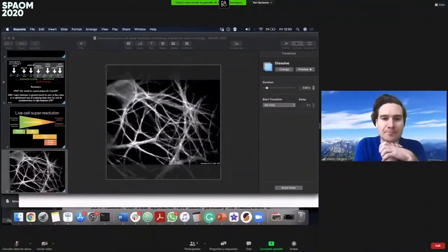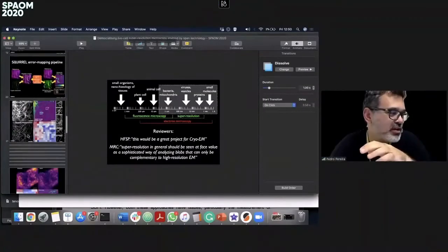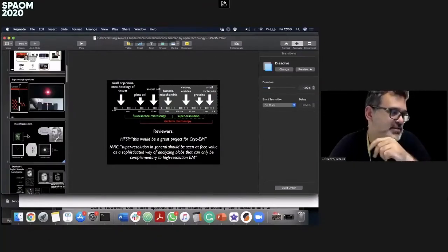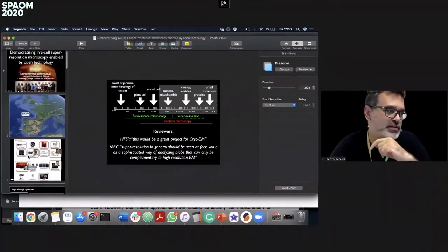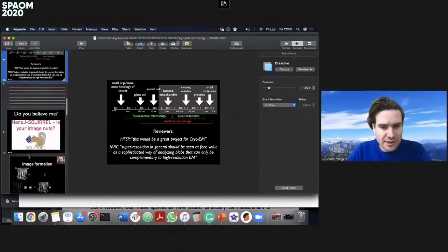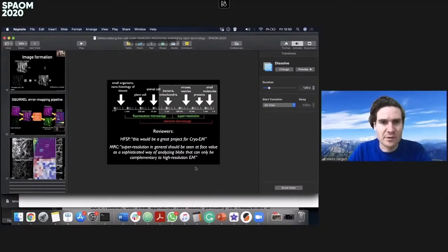Okay, so Bran basically answered in the chat saying that yes, the input has red and green fluorescent channels. I don't see the chat correctly, or that's in Hoppy probably.